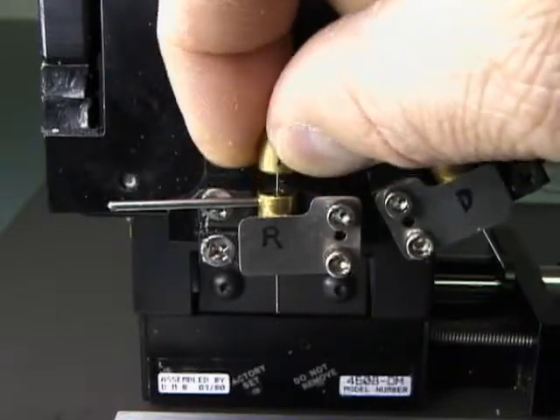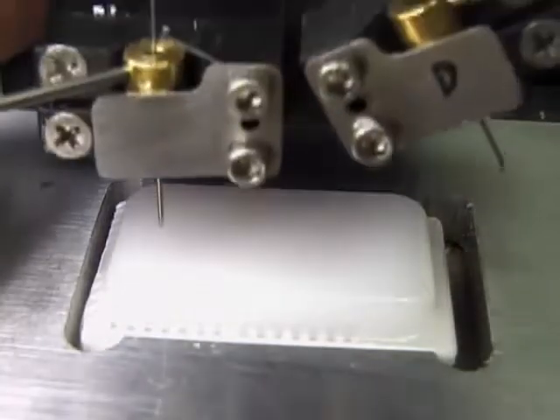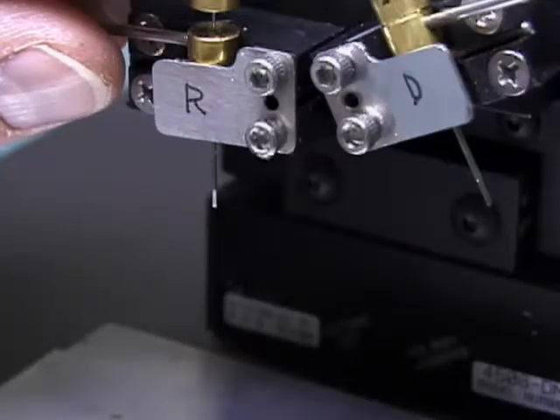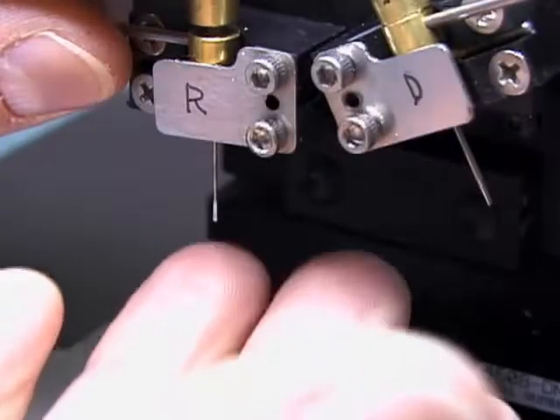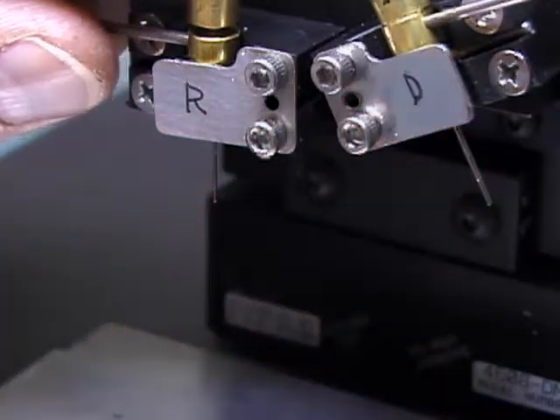Switch the turret to the recipient needle, which is the smaller needle. Before punching, pull the stylet out of the needle. This will allow the paraffin to fill the needle. Punch the recipient block with an even, steady motion. Lift up gently, then push the stylet down carefully to extract the paraffin.